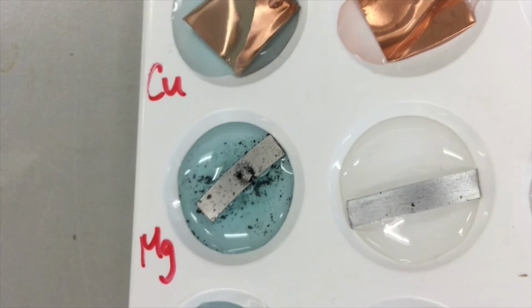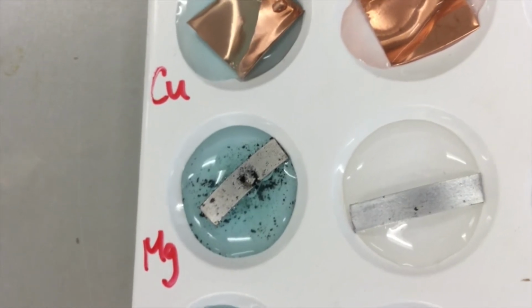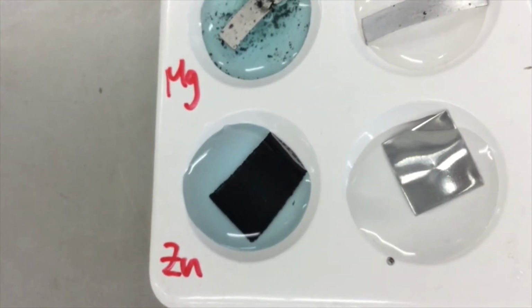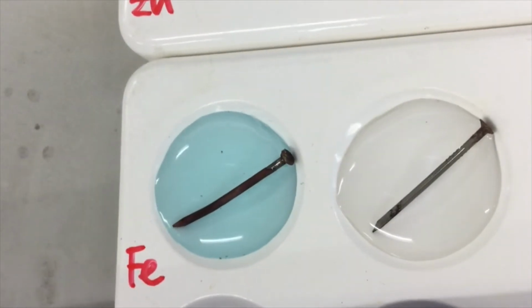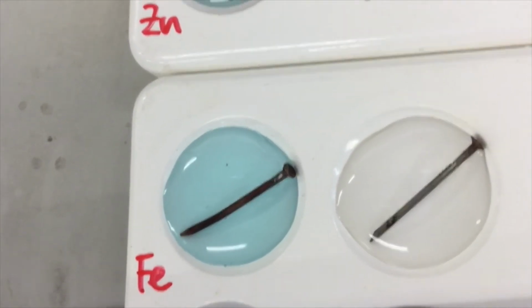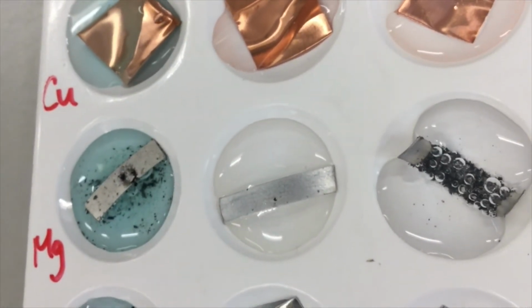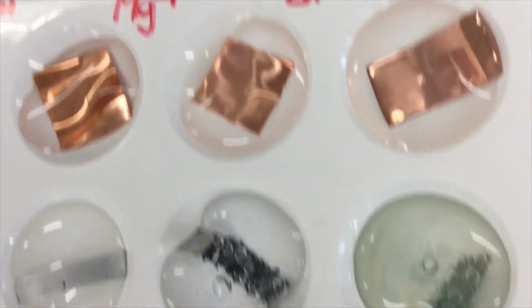Consider the first vertical column, which contains copper-2 sulfate solution. Magnesium gives black solid. Zinc also gives black solid. And iron gives reddish-brown solid. Consider the second column with magnesium sulfate solution. No observable change for all four metals.